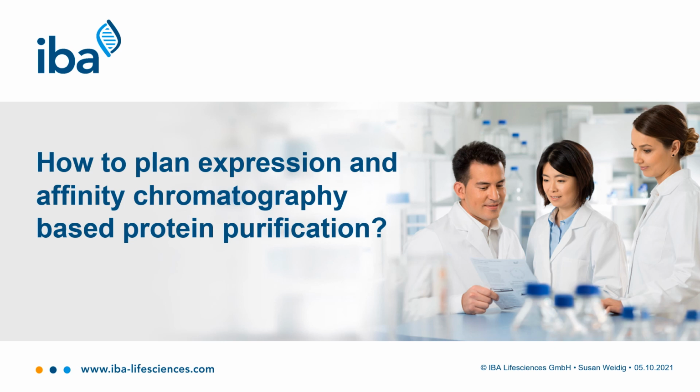And I'm pleased to talk about a frequently asked and extensive question in the field of protein production. And I thank our participants for joining our webinar dealing with this question, and I hope my explanation meets your expectations. So we want to talk about how to plan the expression of a recombinant target protein and the subsequent purification by affinity chromatography.